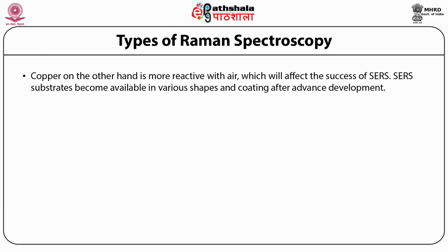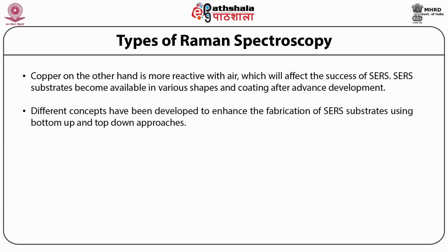SERS substrates become available in various shapes and coatings after advanced development. Different concepts have been developed to enhance the fabrication of SERS substrates using bottom-up and top-down approaches.